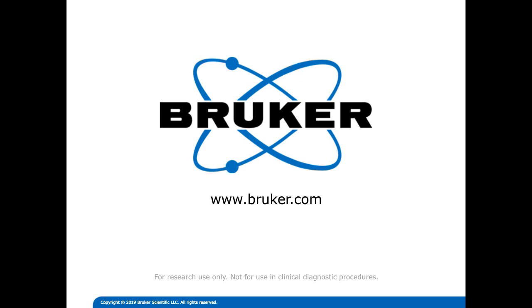Another question that came in asked, are there recommended calibration standards for your MALDI TOF instrument? Yes, there are recommended standards, and we do offer a calibration kit for the MALDI TOF instruments. But having said that, it's also possible to use a lot of other more readily available standards that you can calibrate the instrument with.